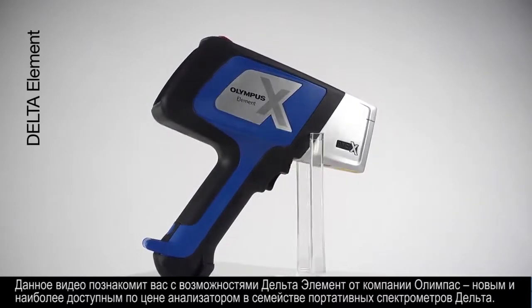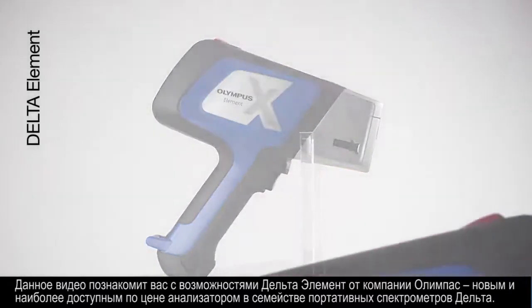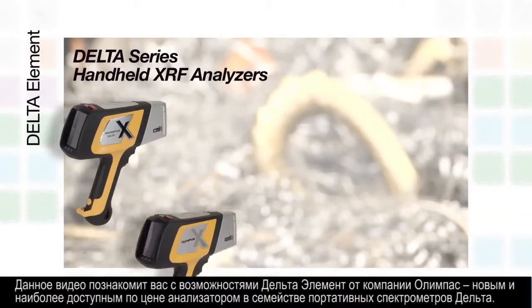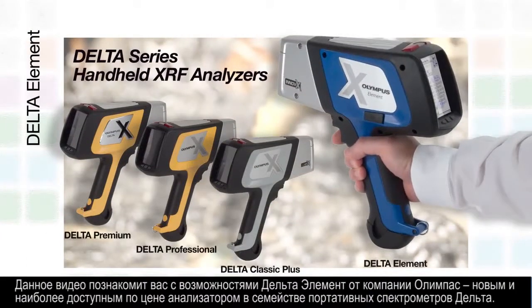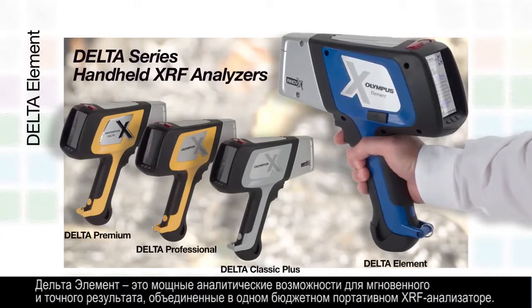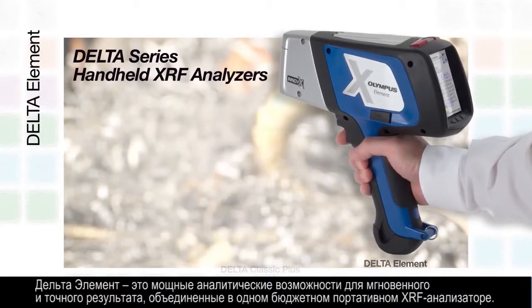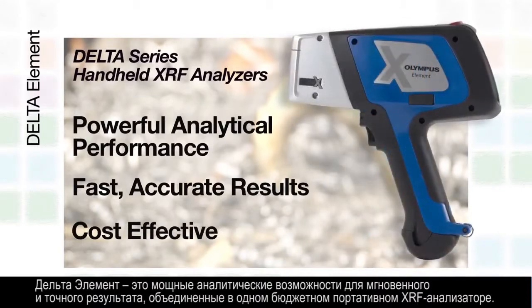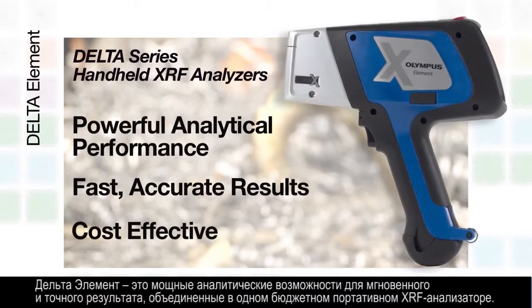This video will introduce you to the Olympus Delta Element, the newest and most affordable addition to the Delta family of handheld XRF analyzers. The Delta Element offers powerful analytical performance for fast, accurate results in a cost-effective handheld XRF analyzer.